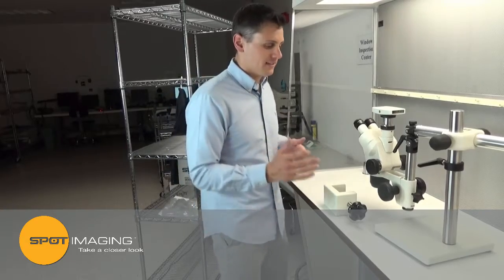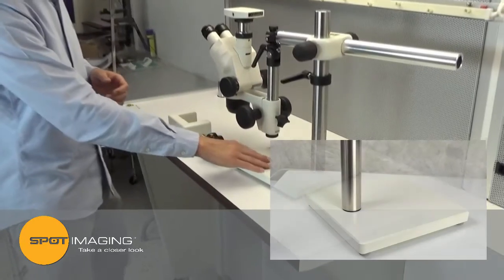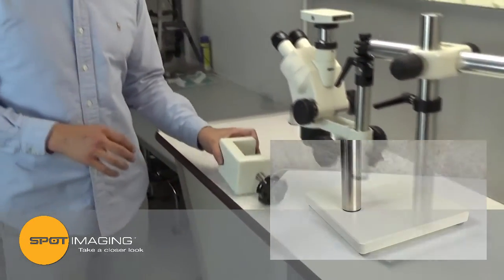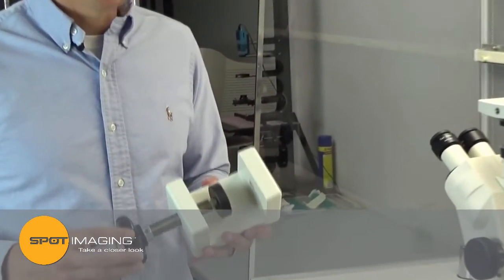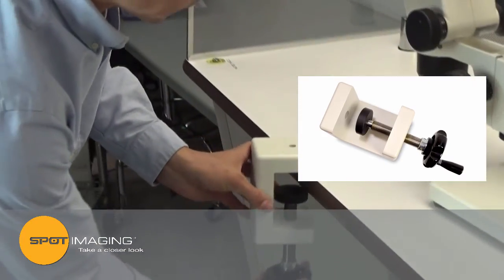This SMS-16 is shown with our solid steel construction SB1 base. You also have the option of using our heavy duty C-clamp to attach the SMS-16 directly to your table.